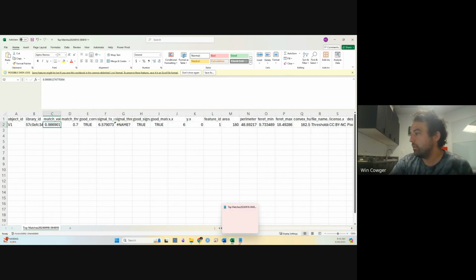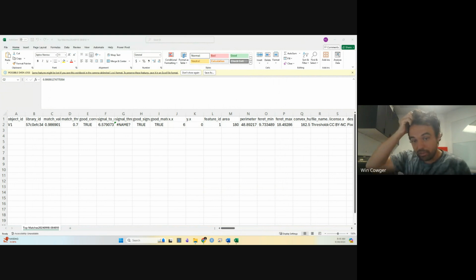All right. Let me pause there again if anybody has any questions at this point, because what we just did was our first hyperspectral image analysis on a single particle hyperspectral image. You basically were able to get particle dimensions and particle identities pretty much automatically with that.